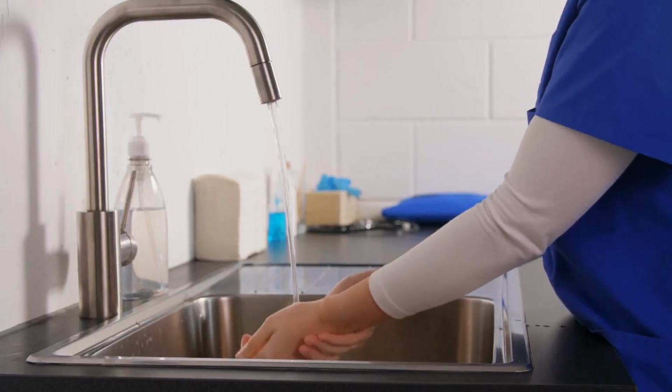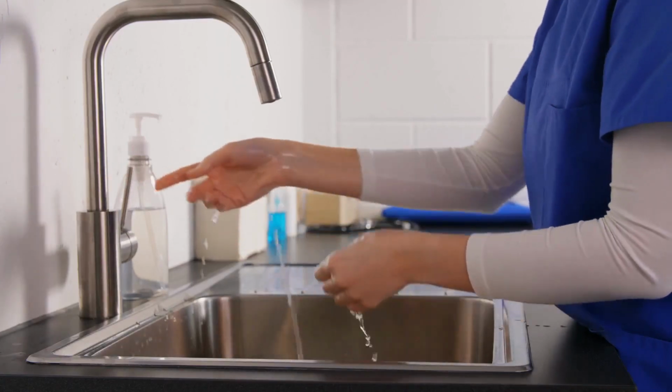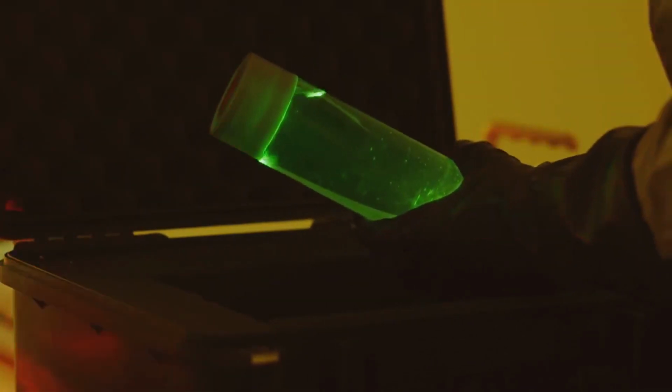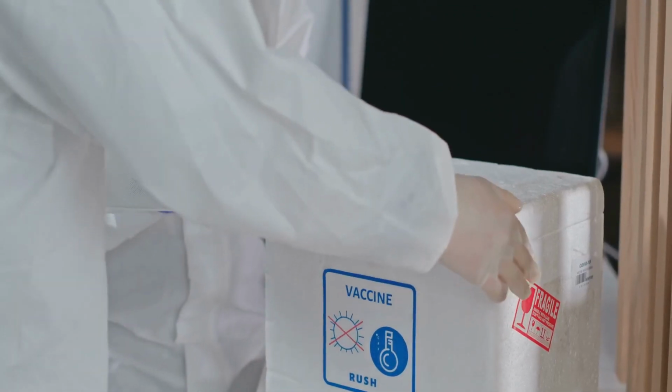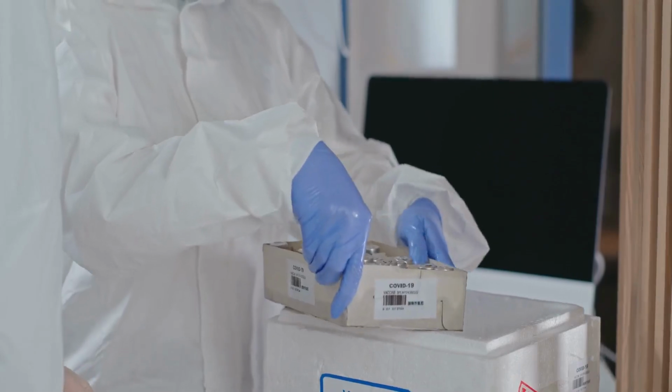How are these topics clinically relevant to your future career? Many of the laboratory safety protocols used are similar to those employed in the healthcare field, such as proper hand washing, use of PPE, and proper disposal of biohazardous materials. The aseptic techniques covered in this section are part of laboratory safety, but are also critical to the prevention of the contamination of cultures.